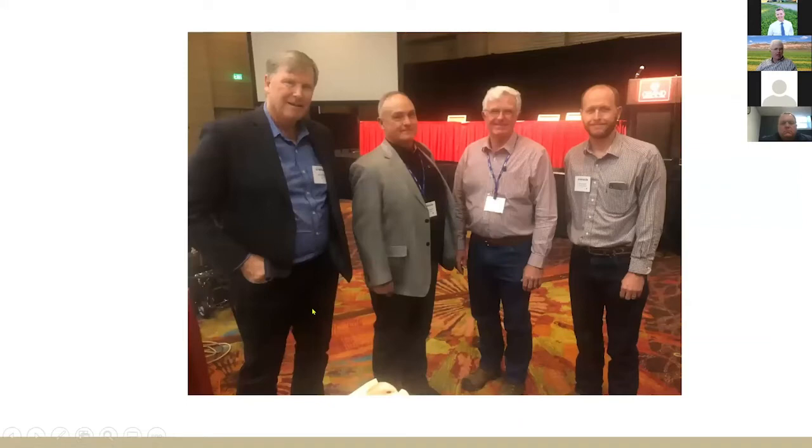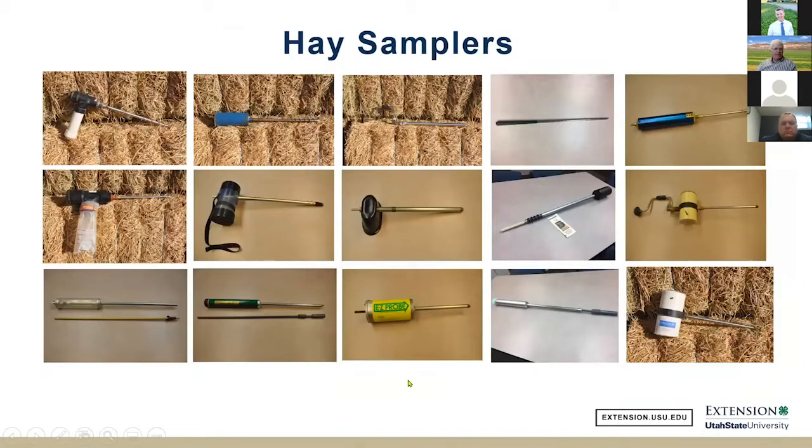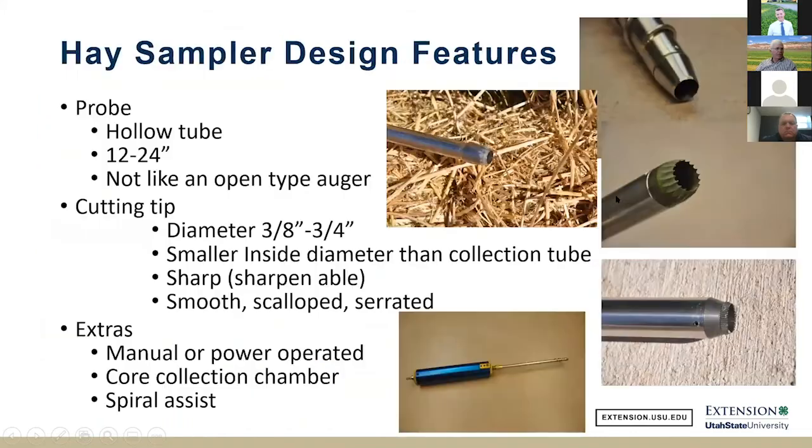We did a bale study a couple of years ago where we looked at different hay samplers. There's many hay samplers on the market. These are just an example of some of them. Another day I could give you information about the good ones and the bad ones. Most hay samplers have some weaknesses, but there are a couple of things you want to look for.